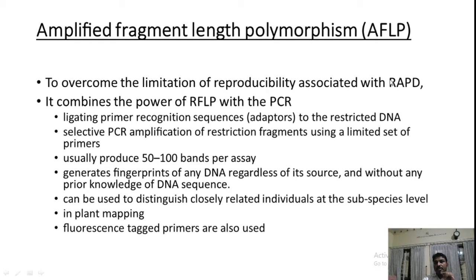Just before that, I just want to go back to RAPD and RFLP because both of them have some sort of setbacks. In the case of RAPD, the results are quite complex, so sometimes it may be hard to interpret. And the second issue with RAPD is that the results, in most cases, cannot be reproduced.